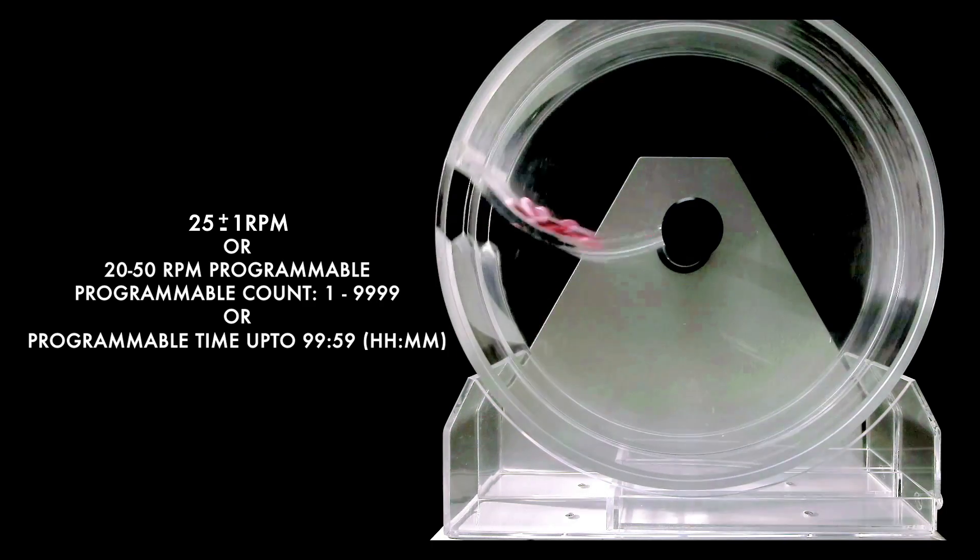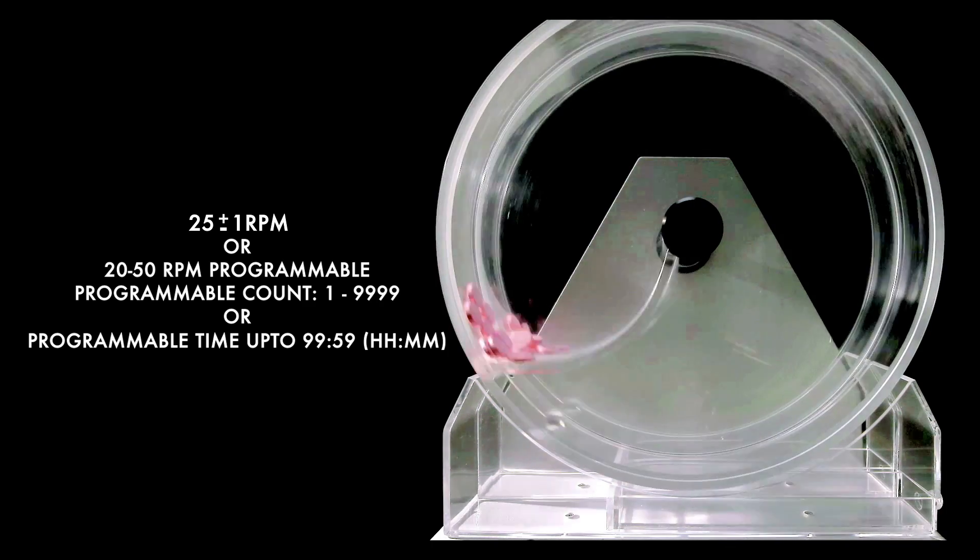RPM counts and time count mode to select and configure the method as per choice at the push of a button.